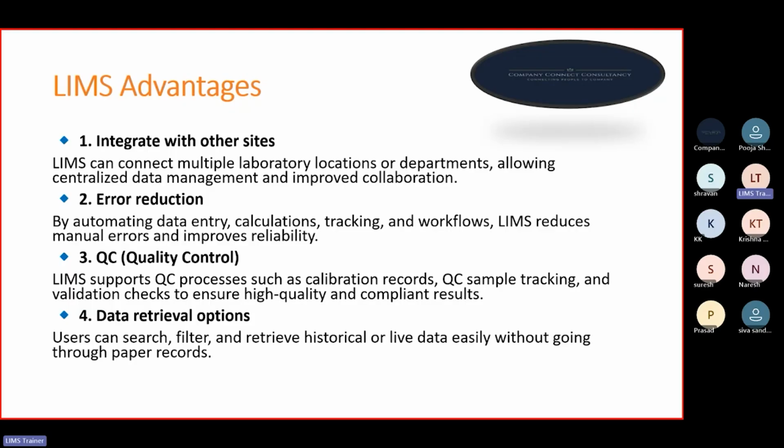But here in the LIMS, you don't have to run anywhere. Just go to the search option, enter the sample ID or whatever unique ID is there, and you will get the data easily. You will get any report easily. You will get any audit history easily. Okay, so that data retrieval option we have here in the LIMS. That is the main advantage of the LIMS.